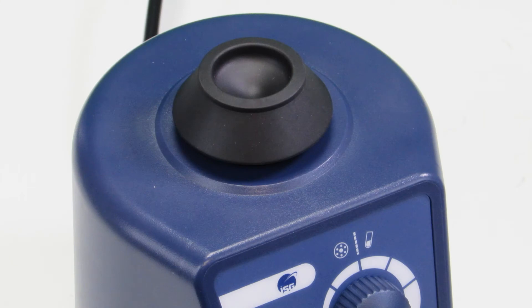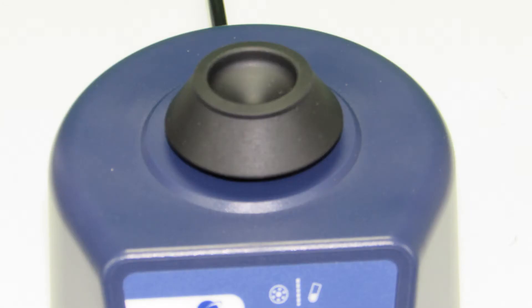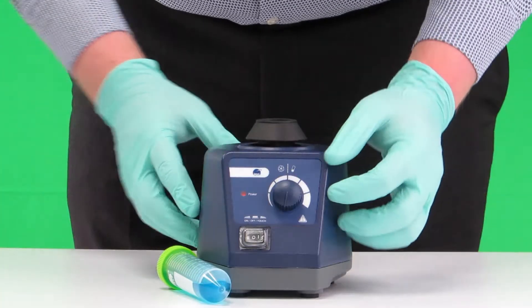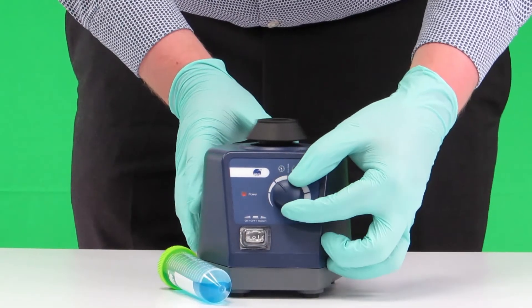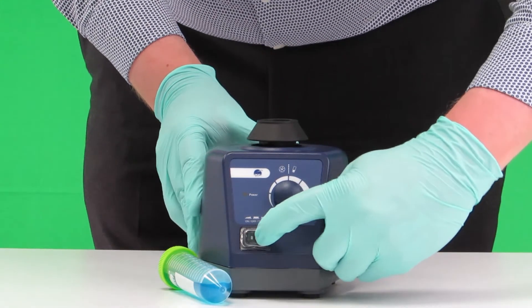The mixer features two modes of operation. The first mode is the always-on setting, which can be used for processing multiple samples one after the other at a consistent speed. This can be set by selecting the continuous setting and then setting the required speed with the control knob.